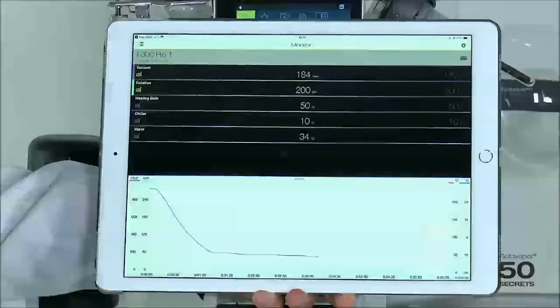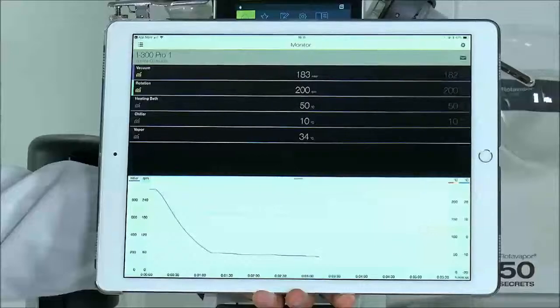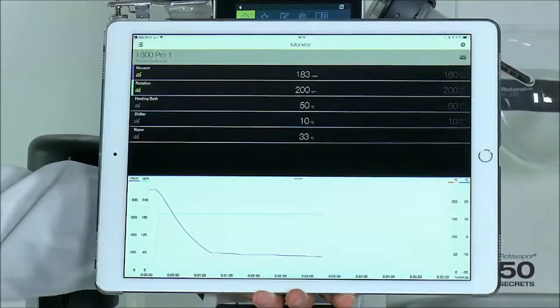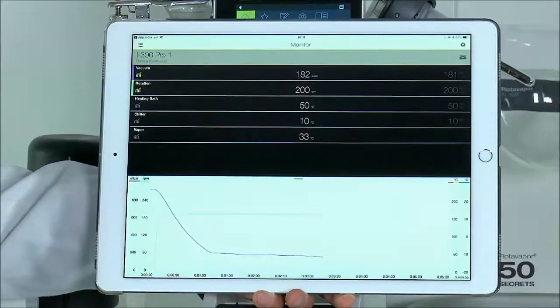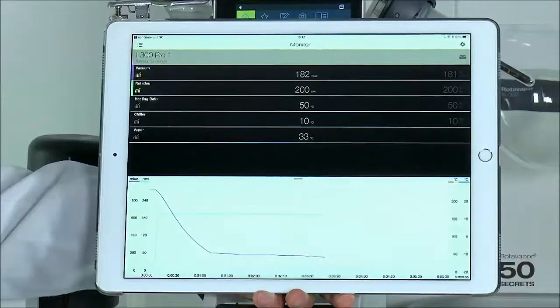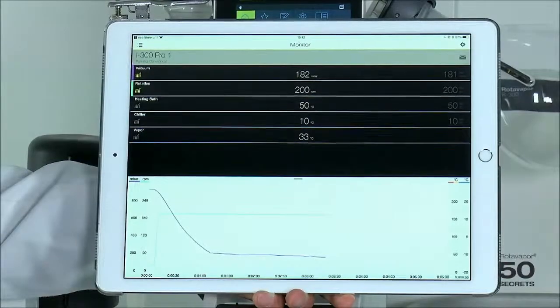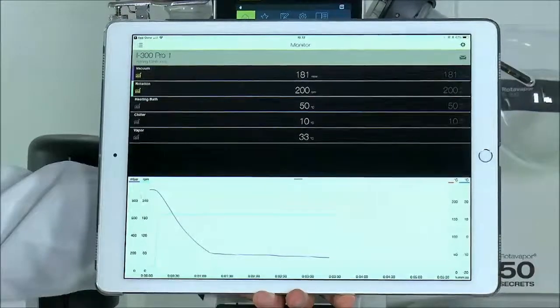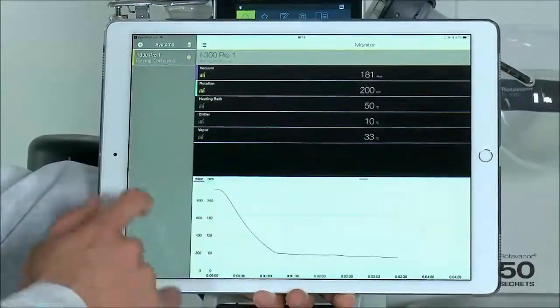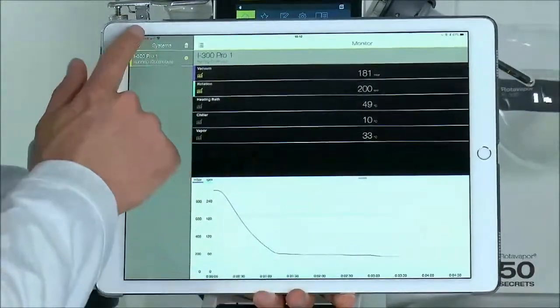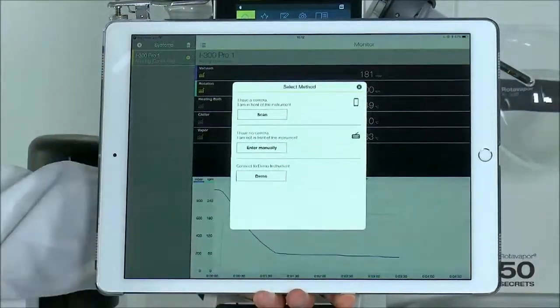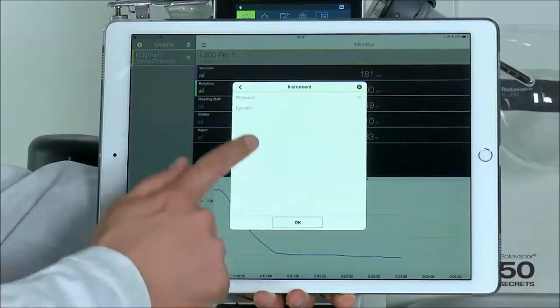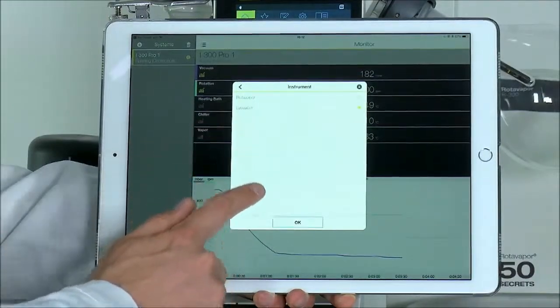After showing you the monitor app on the Apple iPhone, I would like to show you the app on the iPad — though it could be any other tablet as well, such as a Windows tablet or an Android tablet. I would like to add the liovapor demo. I just slide to the side, add a demo instrument, and select the liovapor.